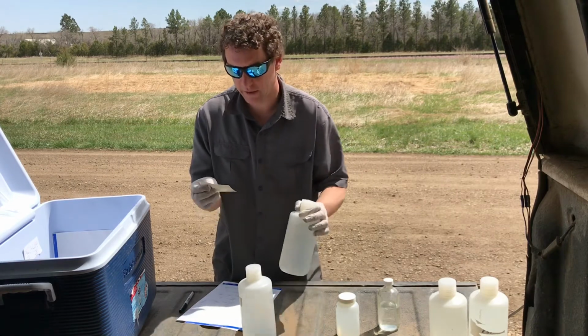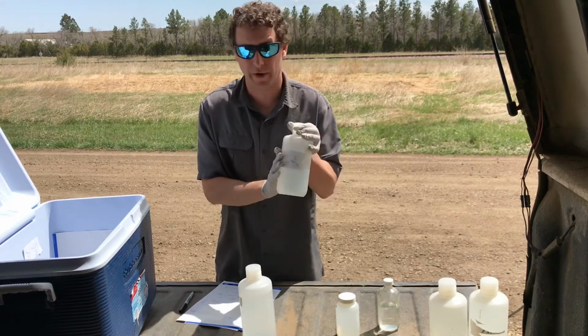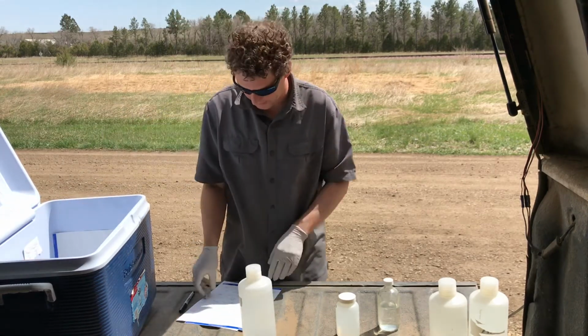So here's our A bottle label. It has a little check there next to the box by the letter A. That goes on one of our 1-liter Nalgenes. That's our A bottle. The A bottle is now complete. It's finished. We can put it in our cooler under loose ice.